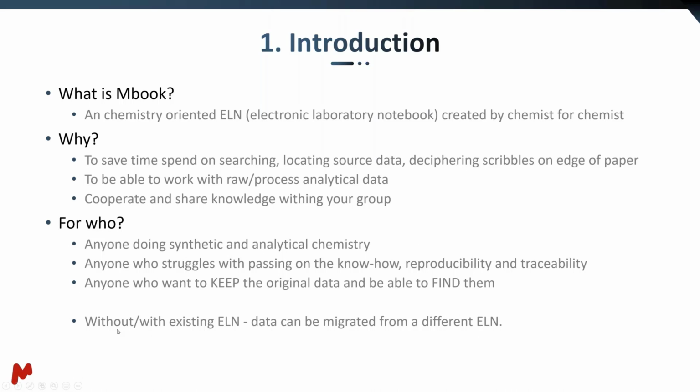And it really doesn't matter if you have already existing ELN or you have none. The data can be migrated, for example, from Perkin Elmer, and just drop us a message that you would like to know more and you would like to see if it's possible.